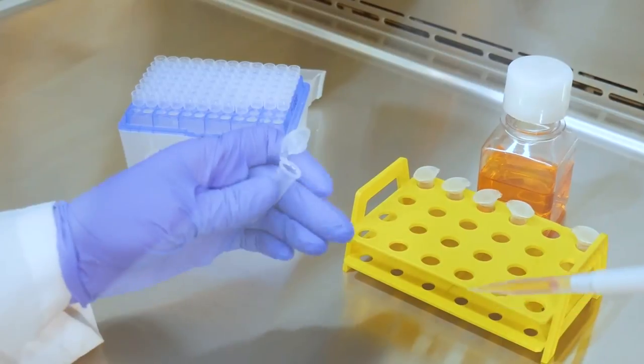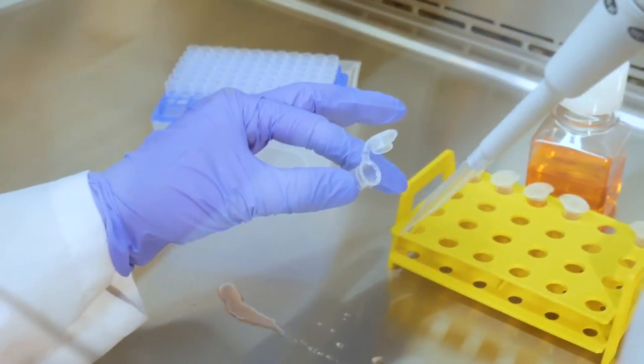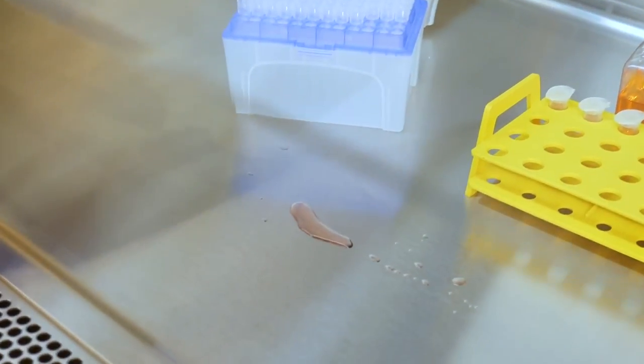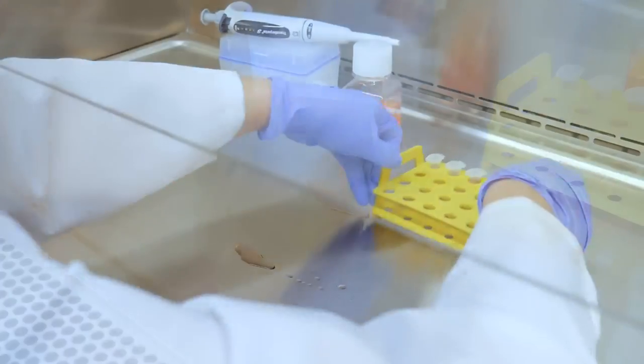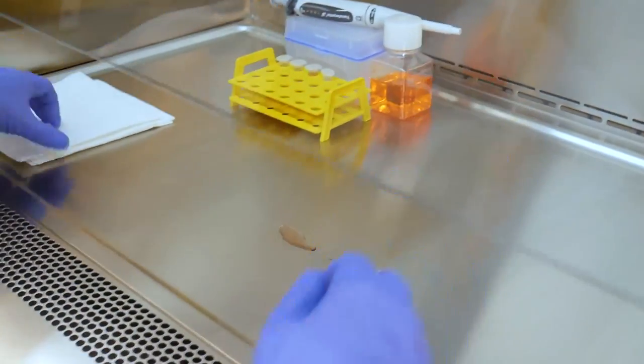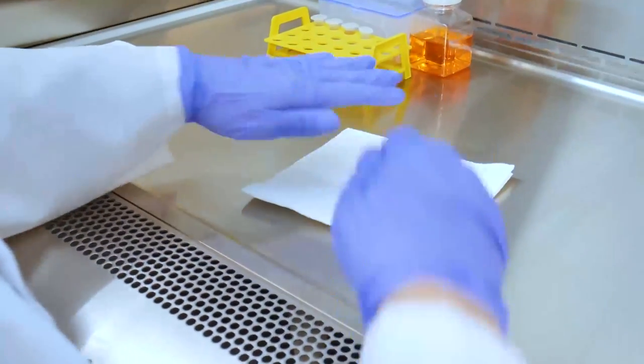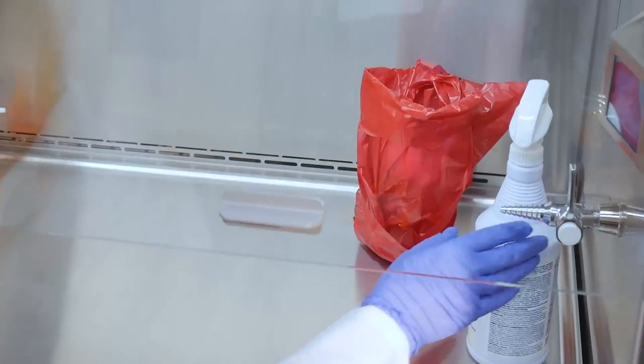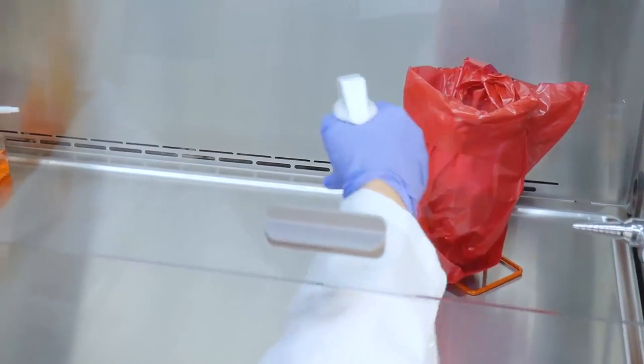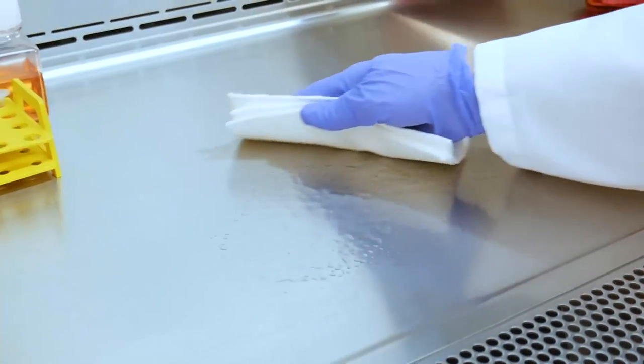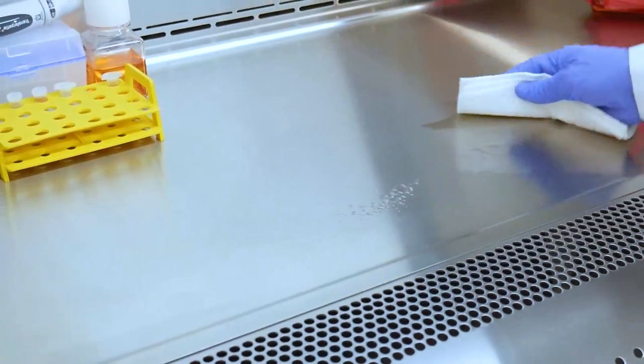If a spill occurs within the cabinet, address it immediately. Leave the BSC's blower running with the sash at operating height while cleaning the spill to ensure that the cabinet contains any aerosols generated during cleanup. Cover the spill with a laboratory wipe to limit spreading within the cabinet. Then apply a suitable disinfectant to the spill and let it sit for the manufacturer's recommended contact time. Wipe up the spill with a disposable lab wiper.